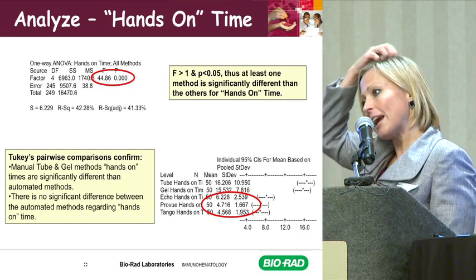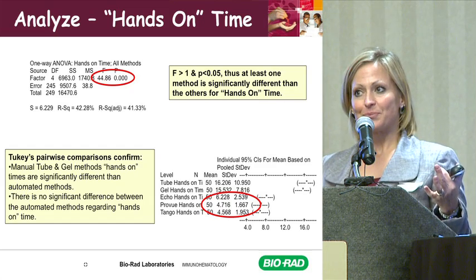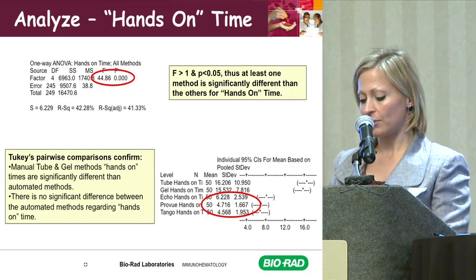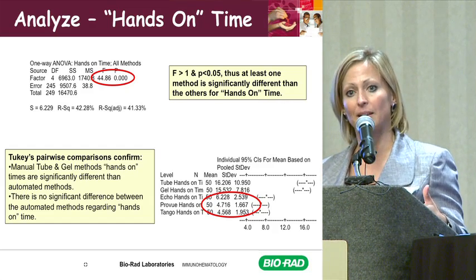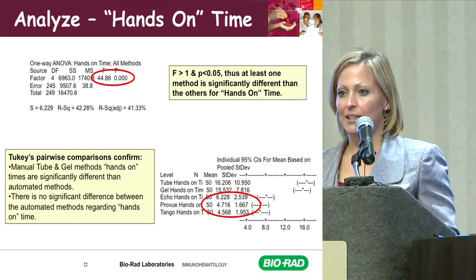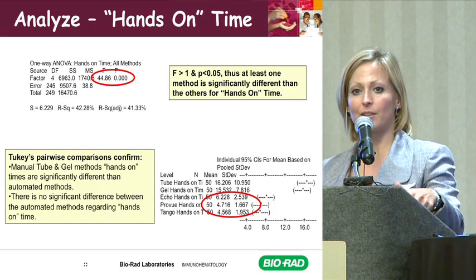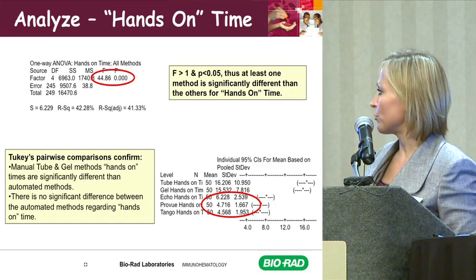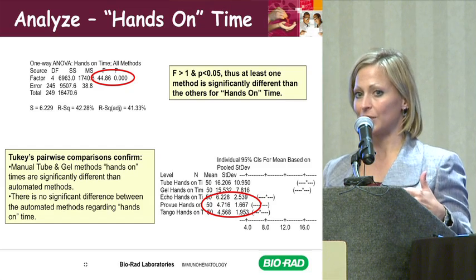Now, I really have to caveat that, because with the workload patterns, the way the samples came in and the way they were managed, they were night and day different. So I was actually very excited about the results, even though it looked like there was no significant difference between the automated methods. I say that because the Echo, fortunately and unfortunately, had no more than two samples loaded at a time, and that whole run would go through, and never was there another overlap. There was no overlap at all with any test run. Then with the ProView, they batched it, and that was it, they were done. So again, it was just very different workflows in each of the facilities.